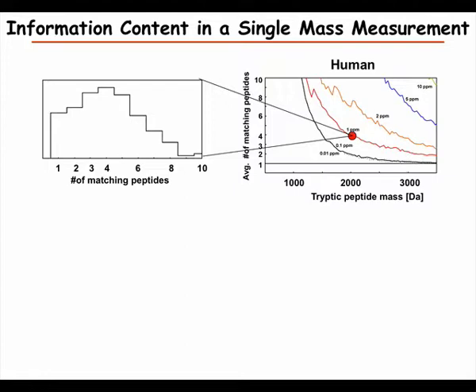So what we've reached is that we can determine the elemental composition at that stage. We have such high accuracy that we can tell exactly which atoms are there, so which amino acids. The only thing we don't know is the order of them, and that we will never get from that measurement, of course.